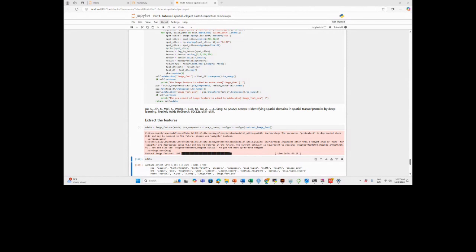So far, do you have any questions, any issues, something that you want to comment? One question before, if you want to always also look at the Q&A, that's where the questions are going to be. Right now we have one that said, can I, for each of the cropped images, find out exactly the transcript expressed? Yes, that's the idea.